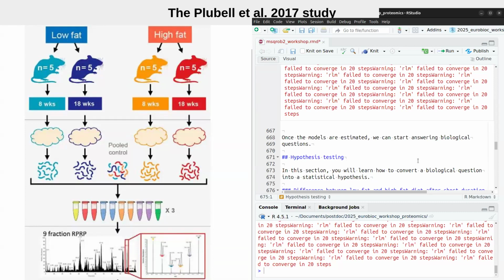For label-free approaches, again, we often start from peptide data as well. So the entrance is at a protein level, but we start from peptide level. So we do differential abundance. We estimate fold changes at a protein level by modeling all the ion level data.